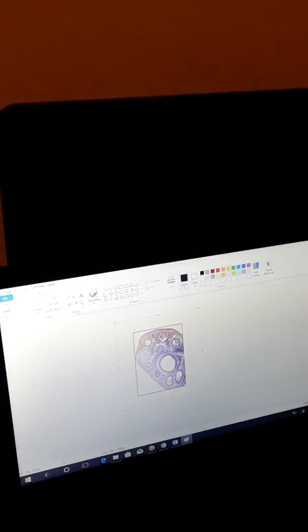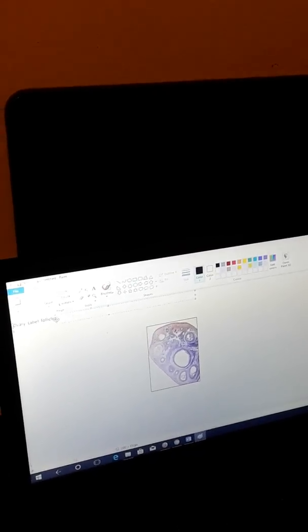What we're going to do is we're going to do the next slide, which is going to be the ovary slide. So again, I'm just going to Control C, which is to copy. And what I'm going to do here is I'm just going to open a new one. And I don't want to save anything. So I'm just going to simply pull it over to where I want it to be. And then in the follicle, which is the ovaries, we're just going to look up for the follicles. So I'm going to go back to paste here. Again, this is just the easier way to do it.